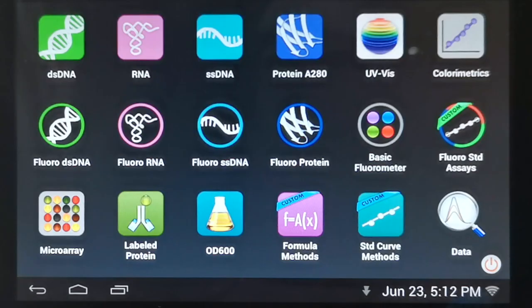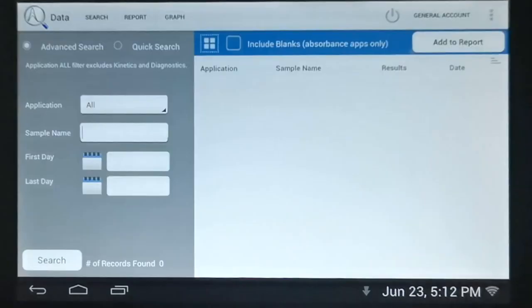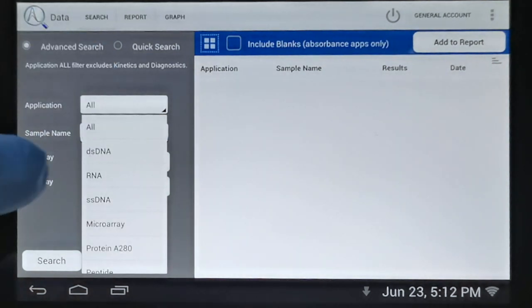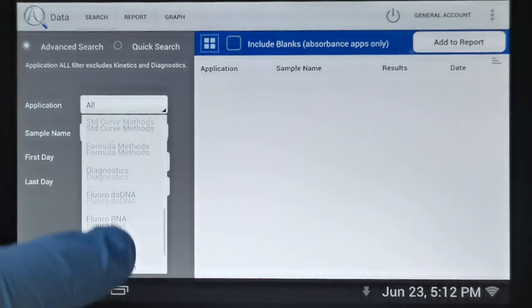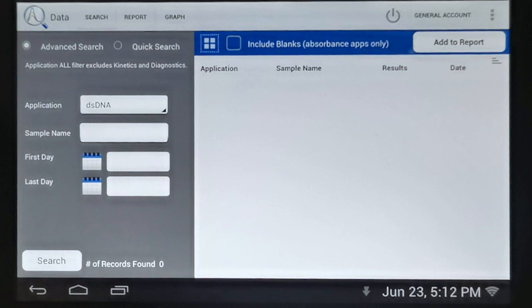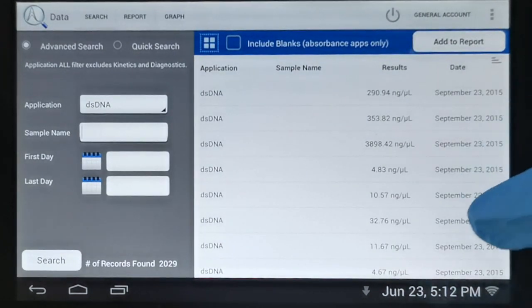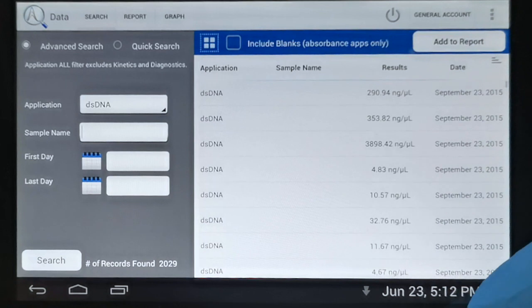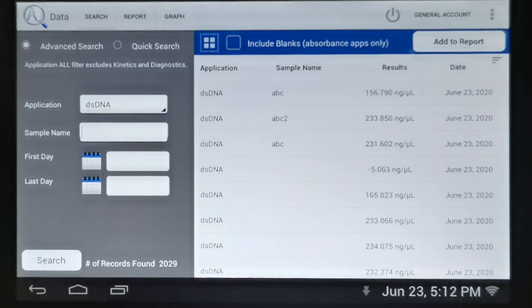Another feature of the DS11 series is that whenever data is captured in any measurement app it's automatically saved, and this data can be accessed from the data app on the home screen. In the data app we can search by application — for example selecting double-stranded DNA — or by sample name and date range. We can search all data on the instrument and it takes just a fraction of a second to bring up all captured data, which can be ordered by any column heading.